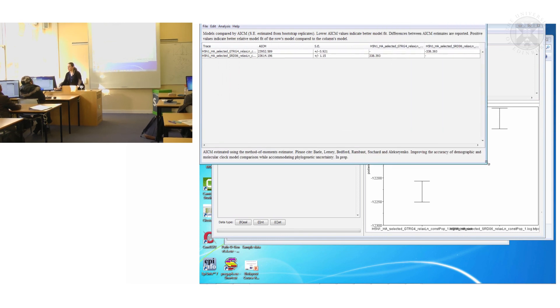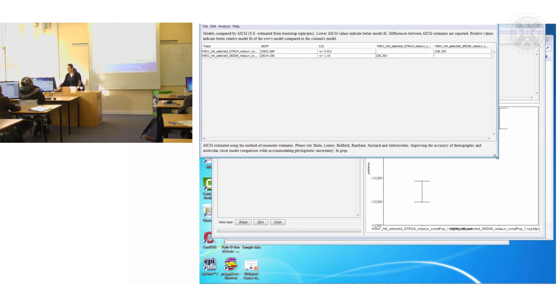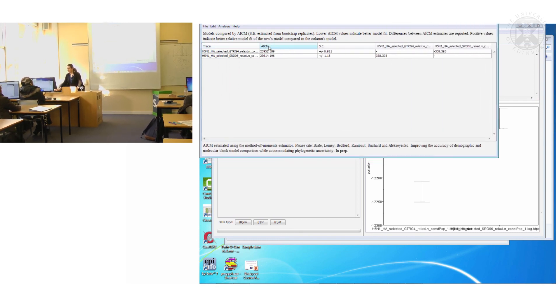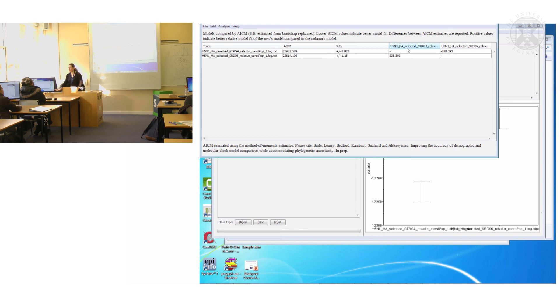So what it has done I hope is it's compared the GTR model with the SRD06 model. In fact the SRD06 model is quite a lot better than the GTR model because this compared to this is positive. OK.